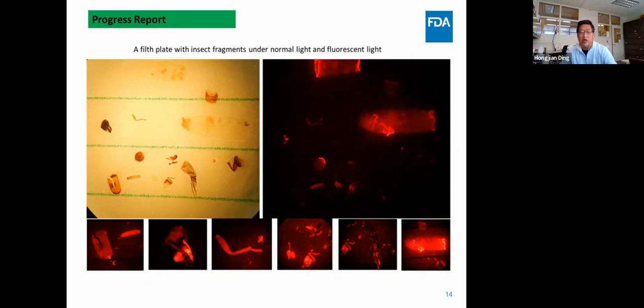So we will go see the part. After this part will be over here. You see one elytra and one larva over here. This one will be an adult antenna over here. This leg will be here.